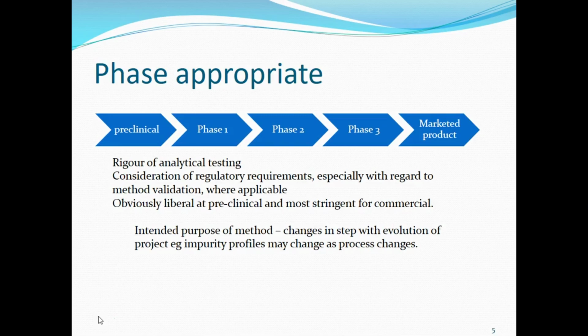So to go into a little bit further detail, phase 1 then: normally you characterize your molecule at phase 1 using FTIR or NMR. You develop your primary methods for purities and impurities, typically HPLC or GC. Now you'd rarely use TLC in this case, because TLC isn't as specific as you'd need it. We'd also look at other impurities at phase 1 stage using LOD, loss on drying, KF, or heavy metals. The knowledge of the stability of the material is important at the phase 1 stage.